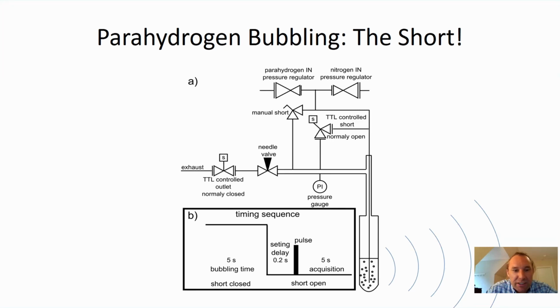And so this short valve really is extremely helpful in terms of just rerouting the hydrogen around, and therefore not creating any problems with the bubbles. There is a question from John: How important is settling? Yes, exactly.